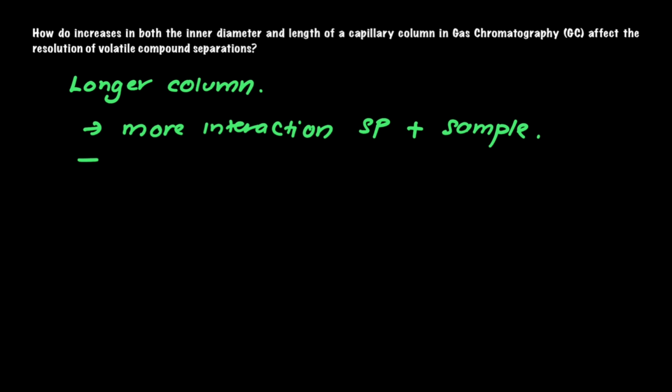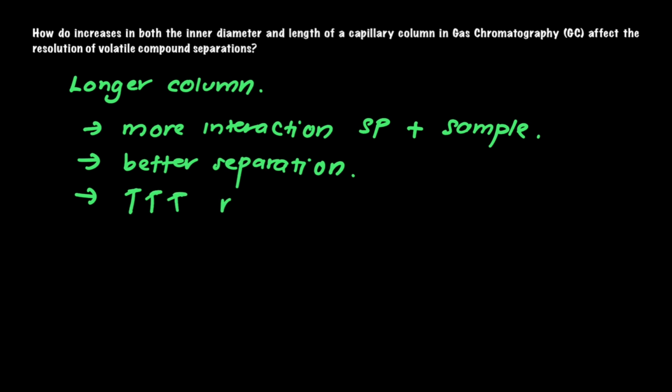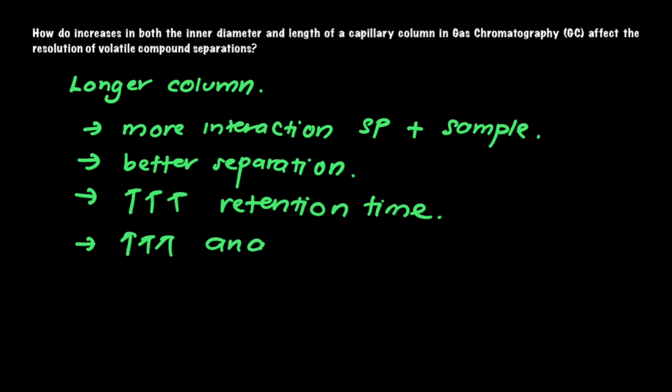Since you have more interaction, it means that it will have better separation. But it will increase the retention time. In other words, it takes longer time for the sample to be eluted out. Therefore, it will need longer analysis time.